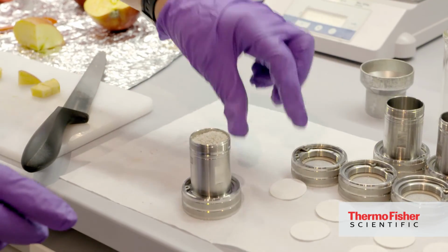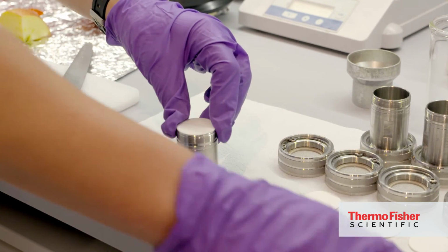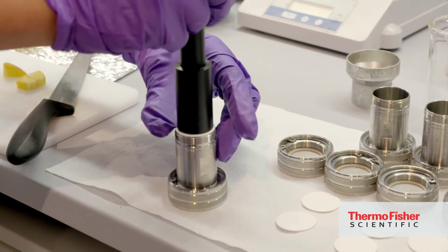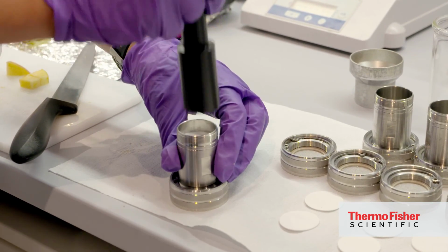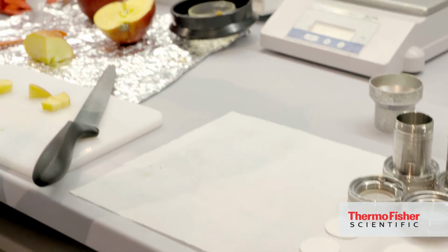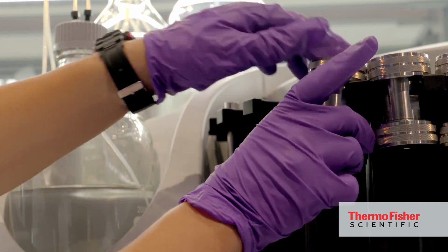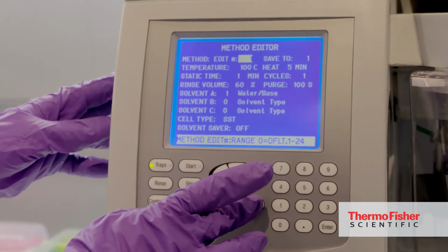When it's ready, we just cover it with a filter. Just push it on the top. And then close the cell, which is ready for extraction. So the ready cell is placed into the tray of the ACE. Different sizes can be put.